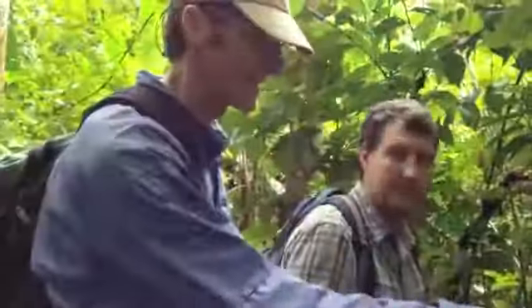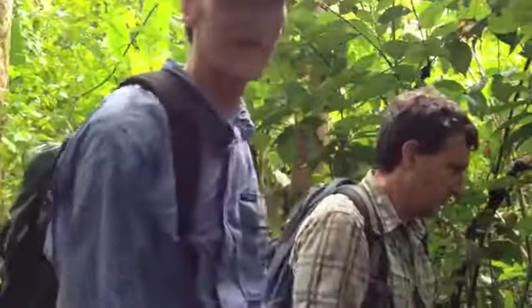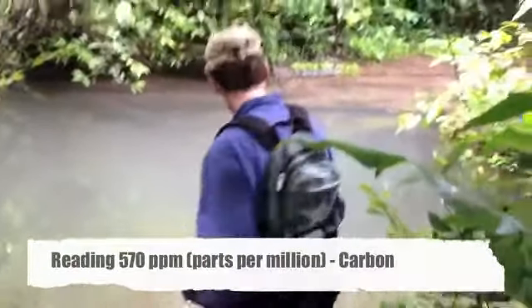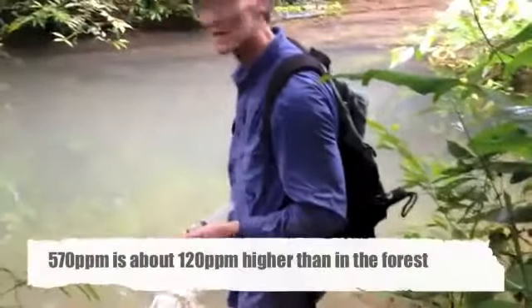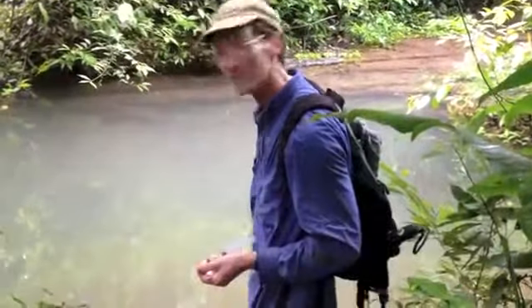I'm going to take my system down there, then when they're done breathing there and the air has moved out, and then I'm going to sample the air that's coming up off of the stream, we think, and it might have evidence of carbon that's come down with the water from the volcanic sources, the rainfall sources upslope there. Okay, well, concentration here, I'm measuring just above the stream, the inlet's back here, and it's reading now 570 ppm, which is probably 120 higher than I would expect if it were just somewhere in the forest.